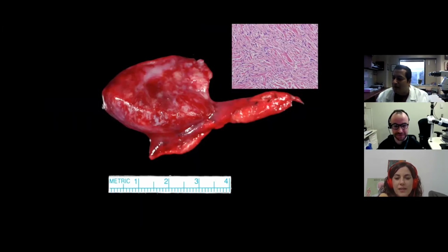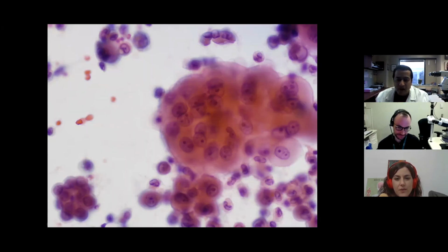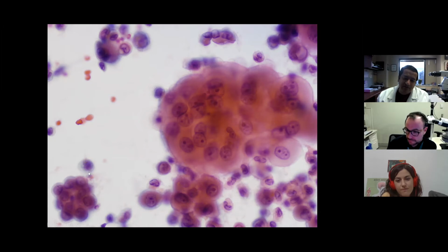Is the little group reactive or are both malignant? I think this one is benign. That's probably a macrophage. And certainly these are all malignant. That one, I'm not sure. That's a very good point, Irene. I see your two population thing, because typically two population things are adenocarcinoma, right? That's really the training. Honestly, I don't know what that is.